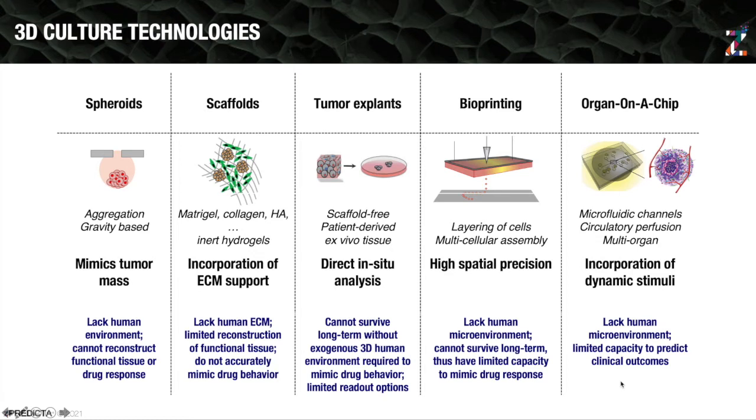There are now multiple technologies within the 3D culture space that are trying to accomplish exactly that. The goal of 3D cultures is to recreate the microenvironment that the drug will see in a patient, and to understand how the drug is going to work before it gets into the clinic. So let's talk briefly about some of the technologies.